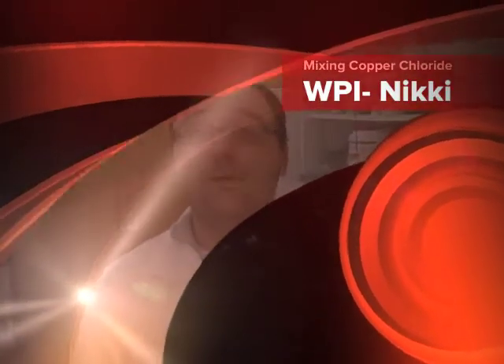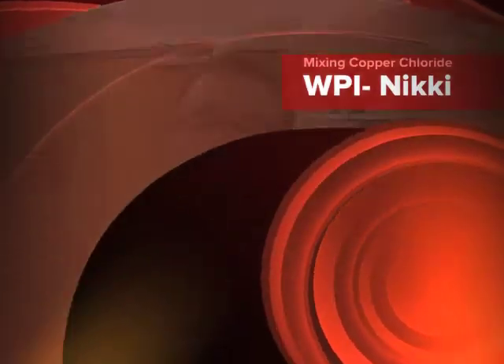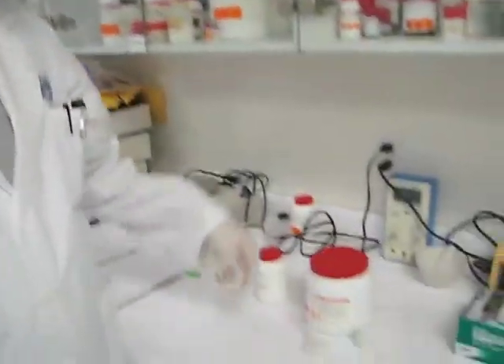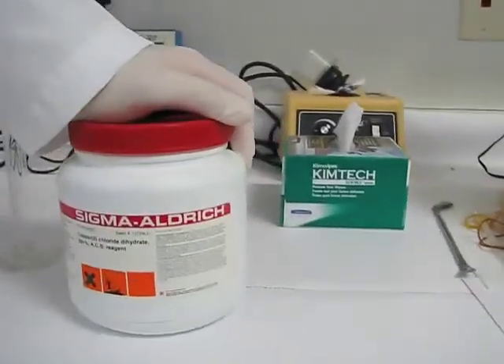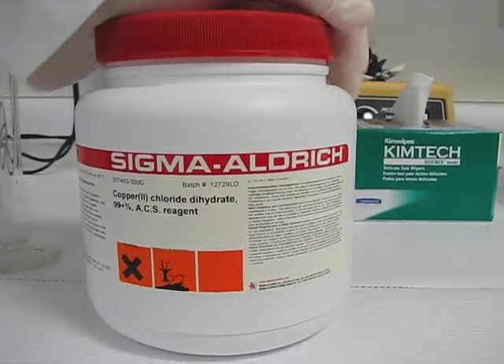Welcome back. Today we're going to show how we prepare some of our mixing solutions for use with calibrating our sensors. I've shown you some of the calibration of the sensors itself, but not the preparation of some of the solutions that we use with the sensors. So today I'm going to show you a couple. The first one is our copper chloride, and we have Sigma as our chemical. This is copper chloride dihydrate, and this is a bluish crystal powder.